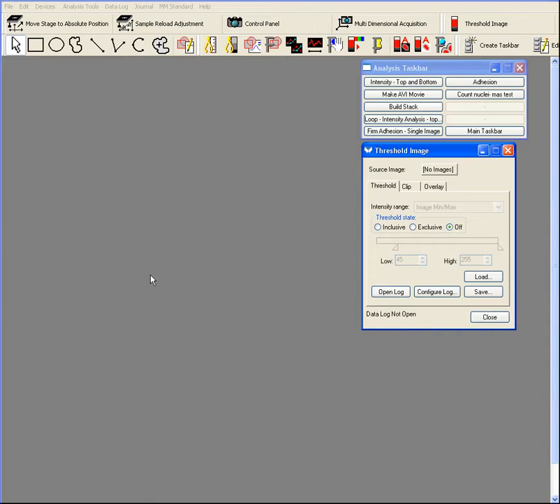This is an example of how we would do a platelet adhesion or thrombus analysis using the BioFlux montage software package.